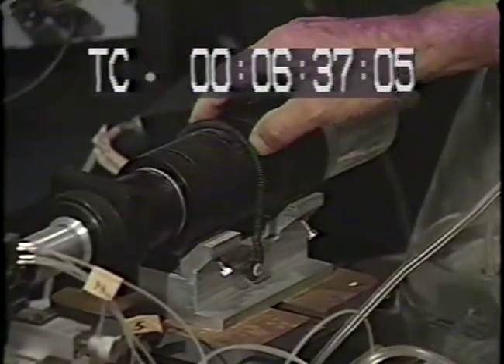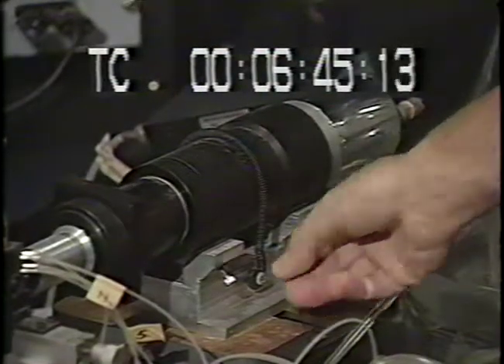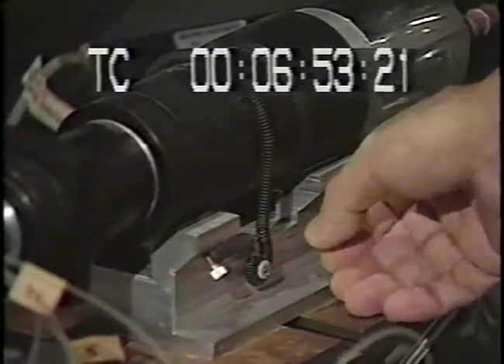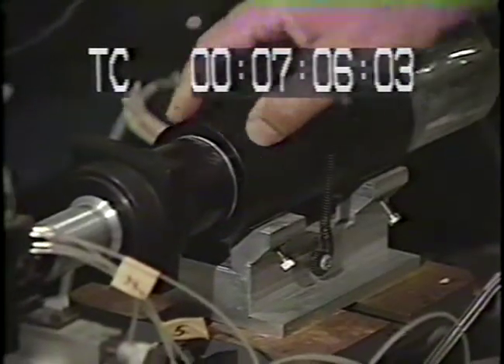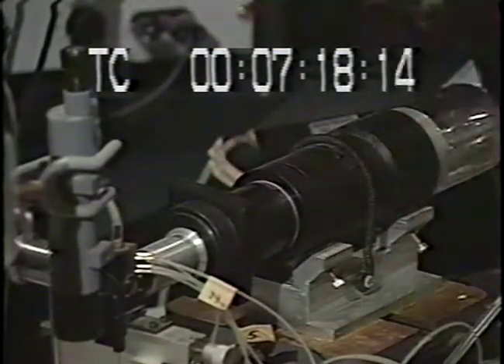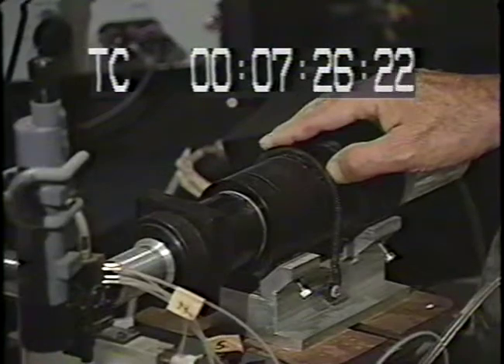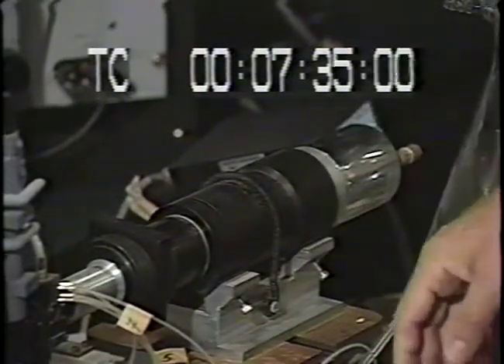I remember that when I first got the instrument, I had a really hard time. I couldn't get it to work at all for a couple of weeks because, as you can see, it's very crude. This is a prototype. I don't know what vintage it is, whether it was the second prototype of Marvin or Mac. I'm not sure. But everything was movable. So until one obtained a signal on the oscilloscope, one was working absolutely blind, and I moved things up and down and couldn't get signals for a long time, and I would call Marvin, what's wrong? But finally I got it to work, and once it's working and one doesn't touch anything, it works very well.